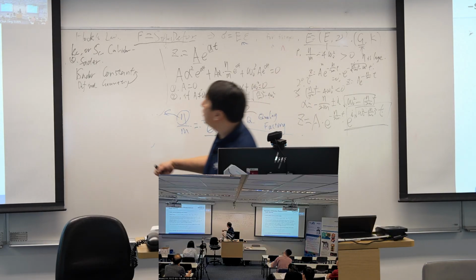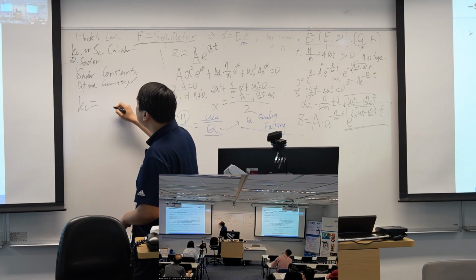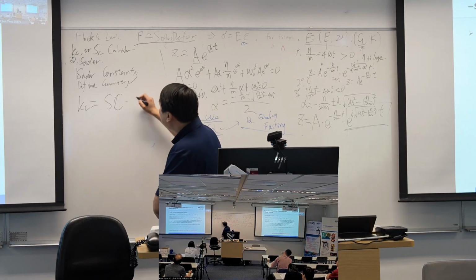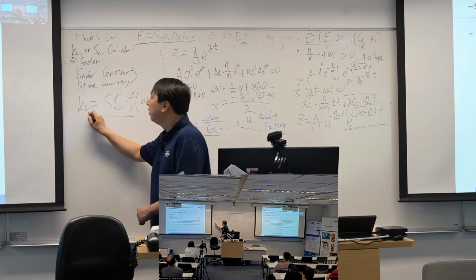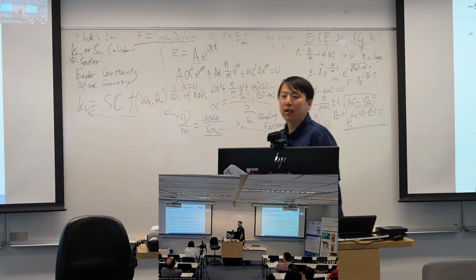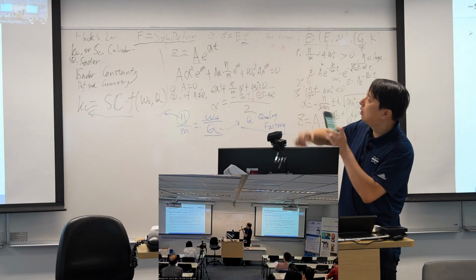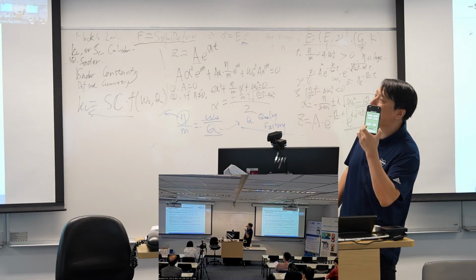So his idea is our Kc is proportional to some Sader constant. And then you type in your resonance frequency and the quality factor. He can give out the spring constant directly without you typing the geometry again on his website or his application.